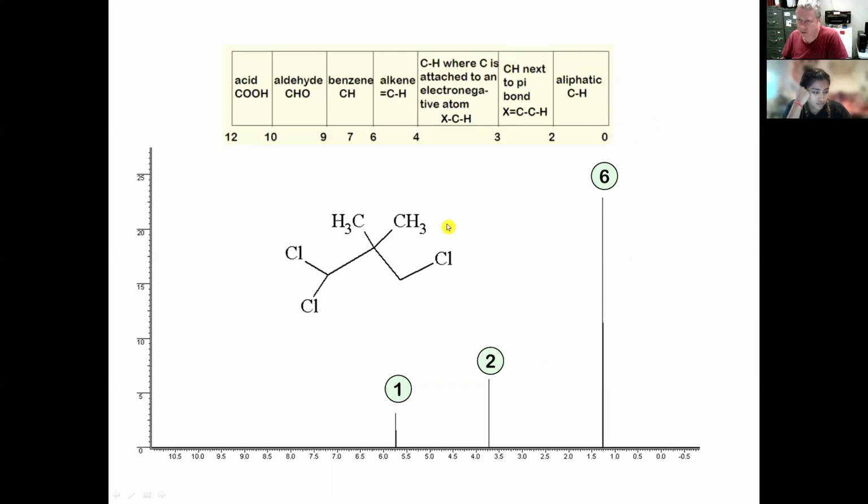Okay, so this molecule, I just picked some random molecules to show this effect. We've got 3 chlorines here, 2 chlorines on this side, 1 chlorine on this side. Did the integrations make sense? 1 to 2 to 6.